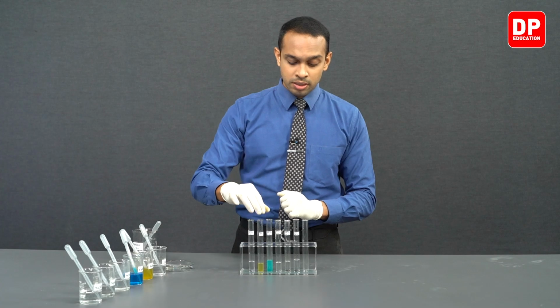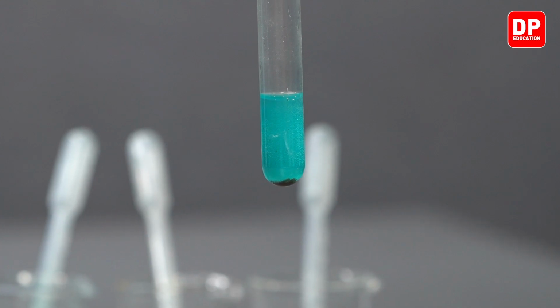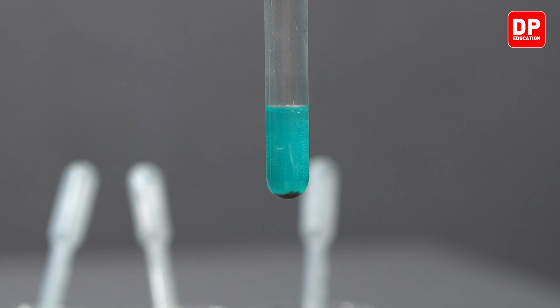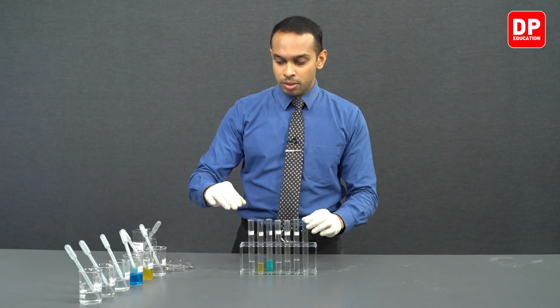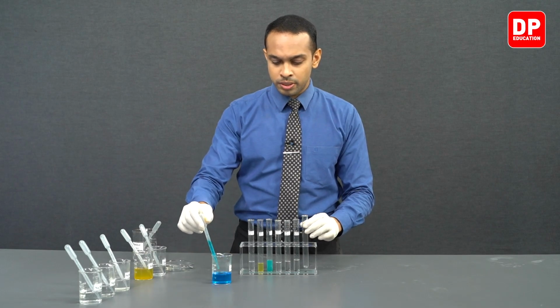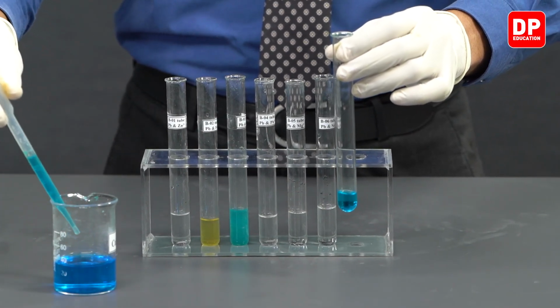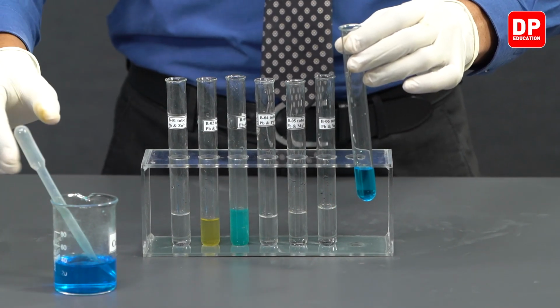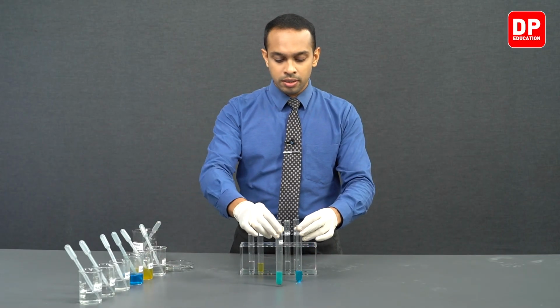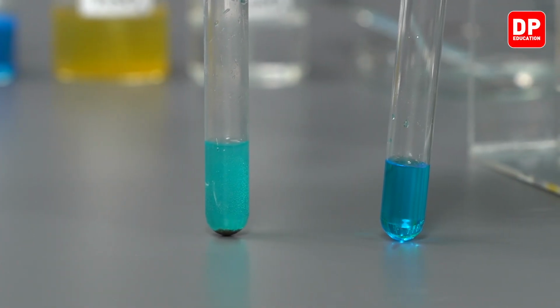However, students, if you take a look at this copper 2 plus aqueous ion solution, it has very clearly shown a color change. To observe the color change a little bit more clearly, we can take a little bit of copper sulfate into another test tube, and we can compare this color with the color of the copper sulfate solution that is added with lead metal.